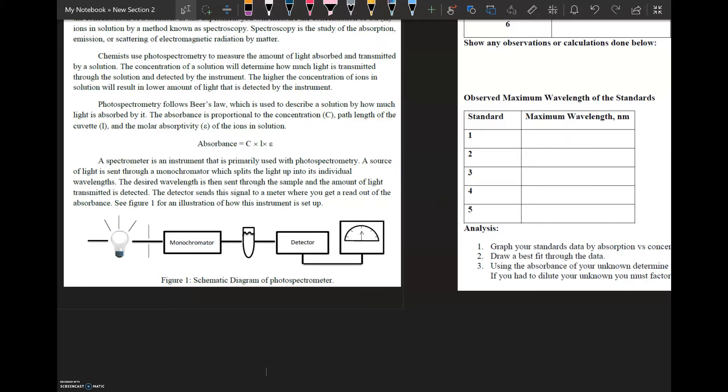When we talk about solutions, there are some solutions that have color in them. Copper 2 has a specific color to it. In fact, copper 2 has a blue color to it. And so what we're going to observe in this particular experiment is how the dilution of the copper 2 solution affects the absorbance that is measured.